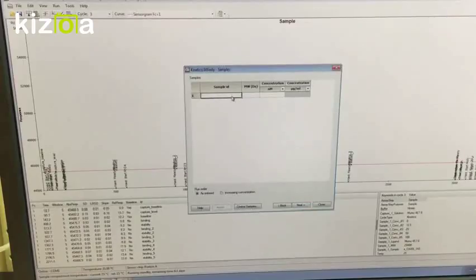Alright, so here you have the different concentrations of the samples that you're going to be trying to find the kinetics data for. For example, so this is the concentration of the analyte. We are going to say, as an example, soluble IL-10 protein.